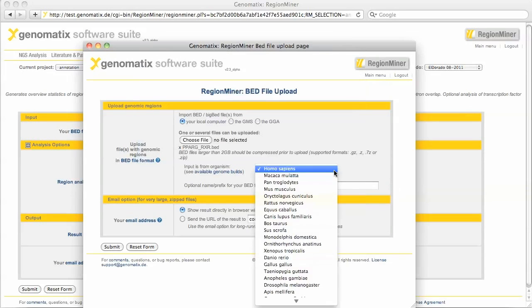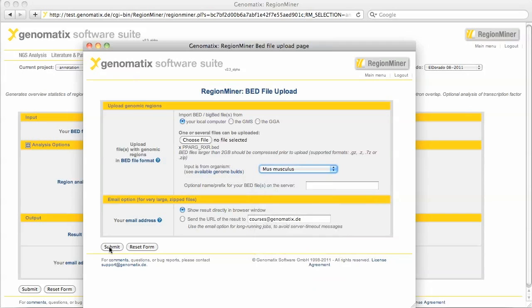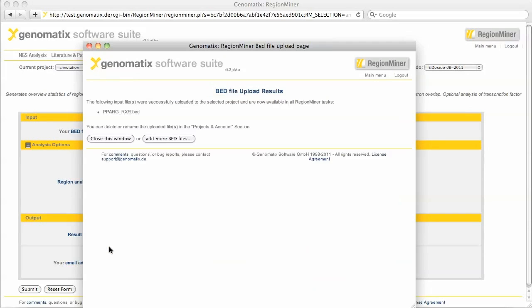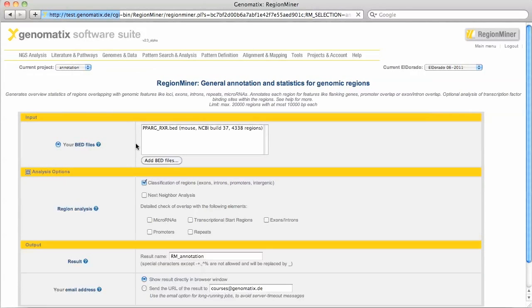In this list we select the mouse as the source organism of our genomic regions. Now we can select the uploaded file in this list.